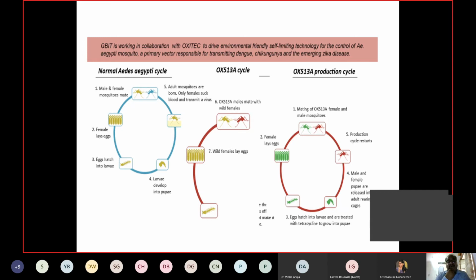with the transgenic mosquito. So this is the rearing of the normal Aedes aegypti. The cycle is very simple. Both the transgenic and the non-transgenic should have an invariably unchanged cycle. The number of days they take for transformation from one stage to another, that is from egg to larva to pupa to adult, must be comparable.